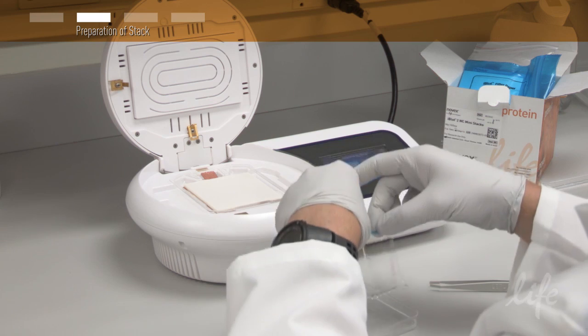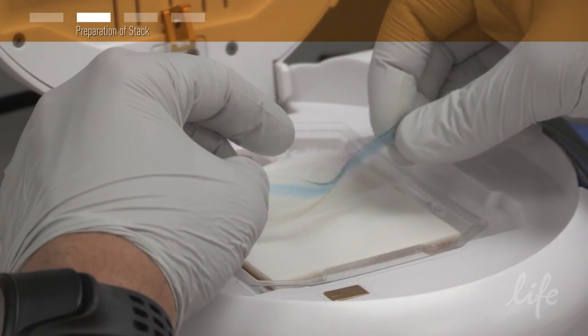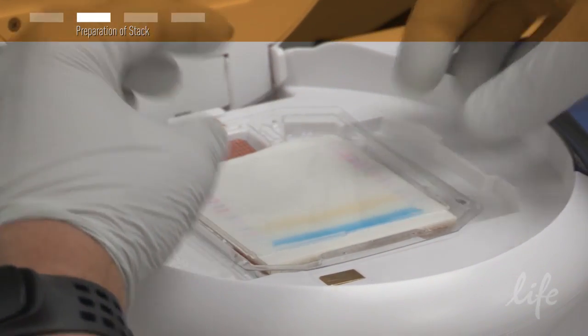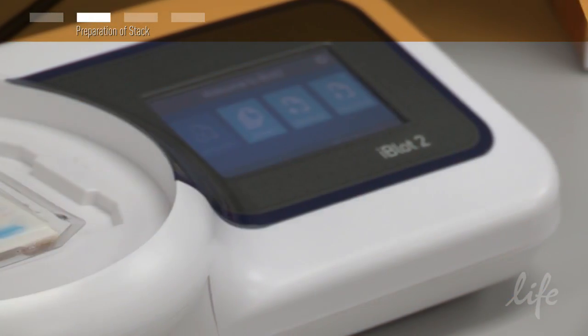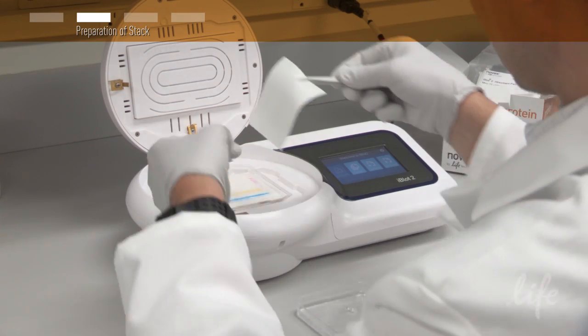Next, pick up your pre-run gel and place it on the transfer membrane of the bottom stack. Pre-soak an iBlot filter paper with deionized water and place it on top of the gel.